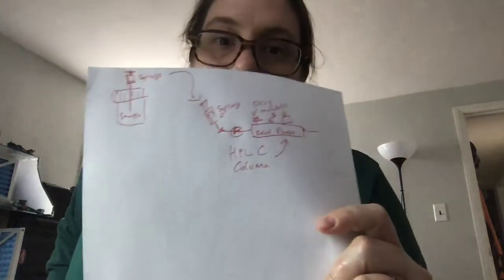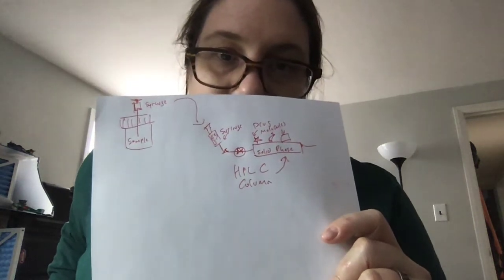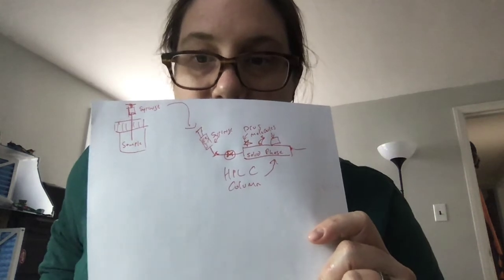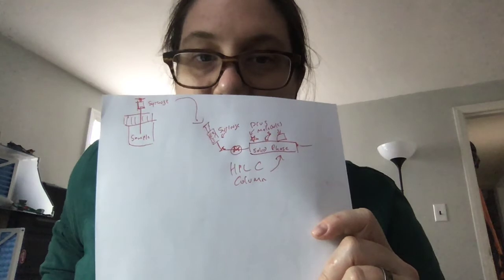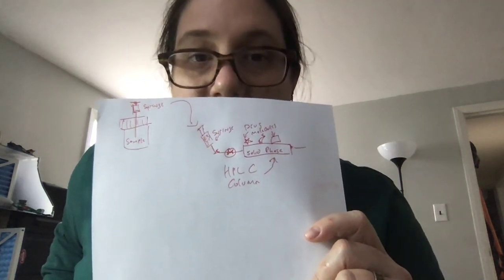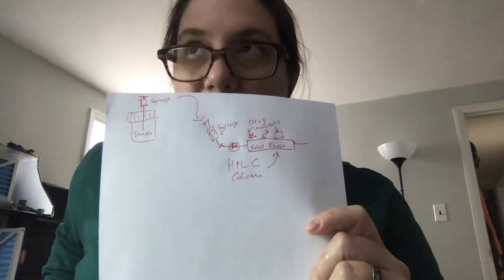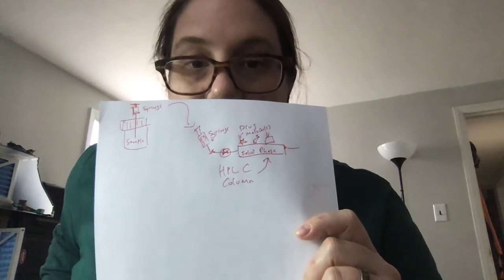From our sample, we're going to have all kinds of different metabolites. We're going to have metabolites from whatever food you ate, from different processes as your organs grow and change, as things die in your body, etc. There are all those waste products or different products existing in the biological sample, so they're going to be available for analysis.